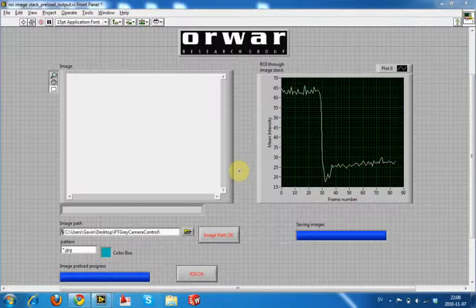So first of all, for those that have looked, the VI that we're working with is an additional add-on to session 2. So this was in the extra section.